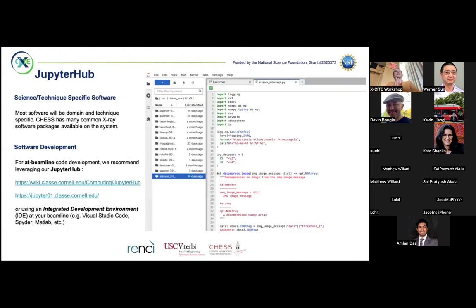JupyterHub is something we're going to interact with today. Before getting into that, a lot of the software that you're interacting with is going to be domain and technique specific, but a lot of it will leverage Python or some common languages across the lab. And CHESS has many common X-ray software packages on the system. I'll have a little nod to that in the next slide.